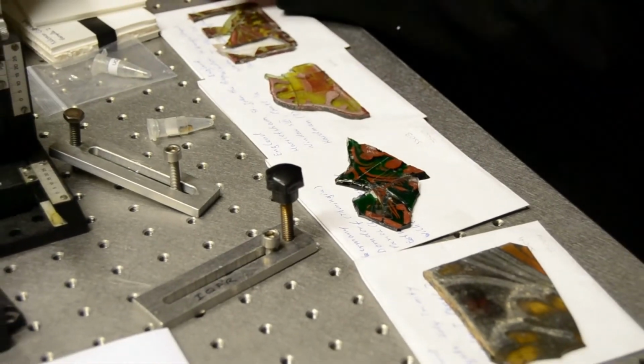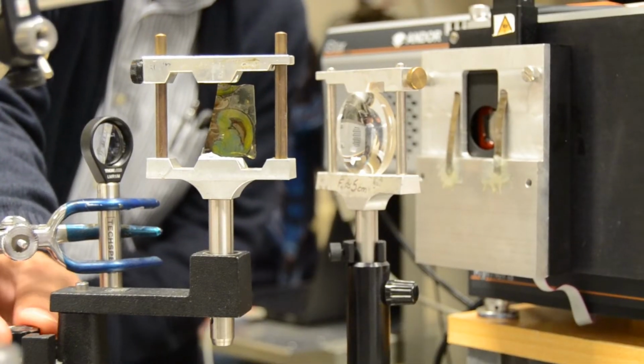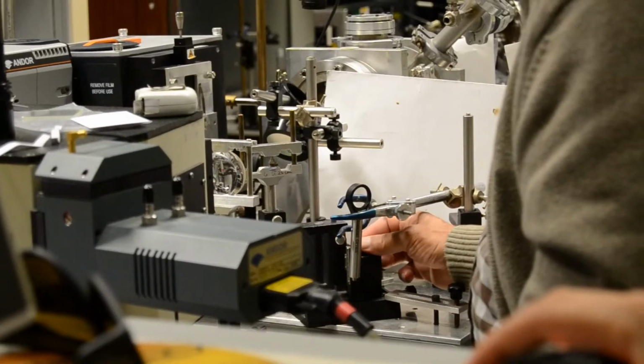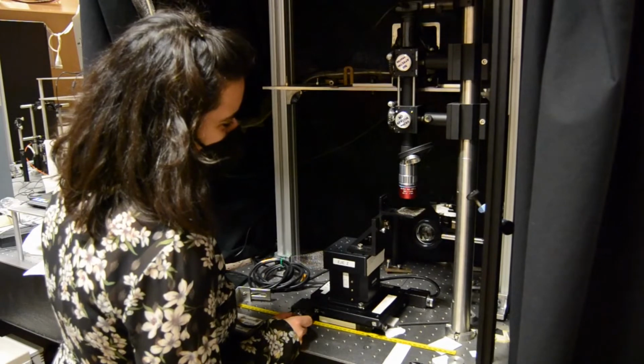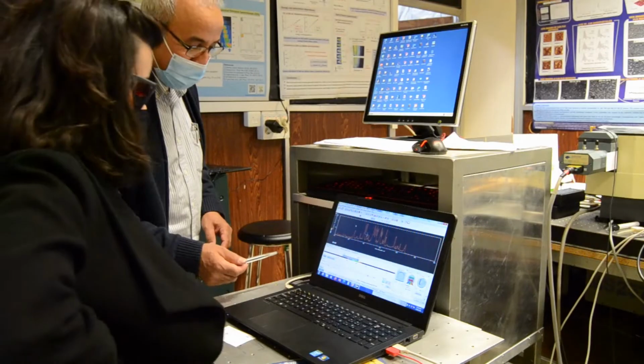I'm here at the Institute of Physical Chemistry Rocasolano in Madrid, assessing their facilities, laboratories and research expertise via FIXLAB access to research infrastructures. I came here in the aim of the European project E-RIHS to develop research on stained glass and mainly on the grisaille paint layers, bringing stained glass fragments and samples from different European contexts and chronologies to be analyzed by laser-induced breakdown spectroscopy, laser-induced fluorescence, and non-linear optical microscopy complemented with multi-photon excitation fluorescence.